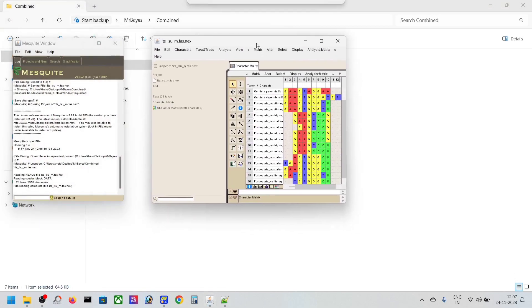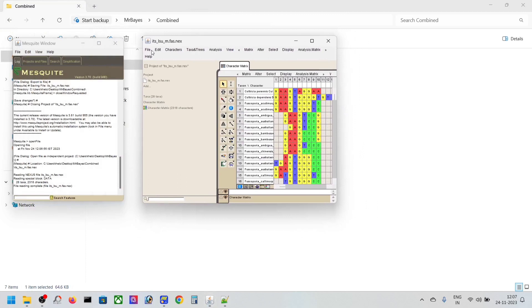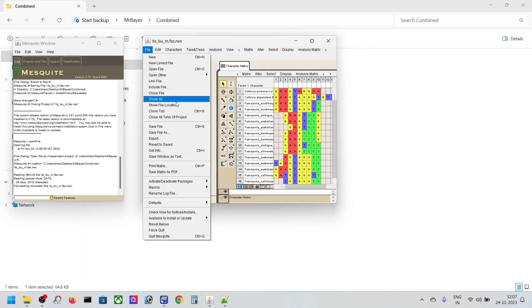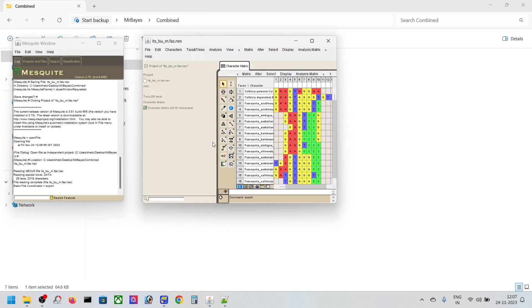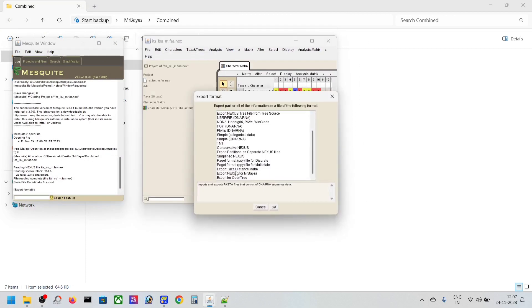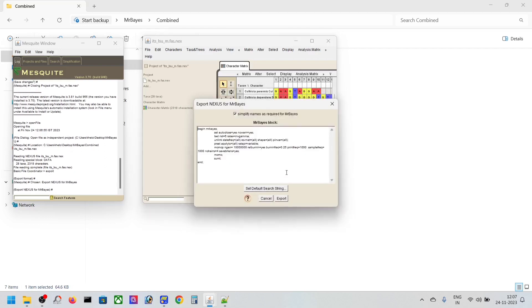Now open Mesquite again and open your file. Then combine and select your Nexus file that you have saved, and then export it as Export Nexus for MrBayes.